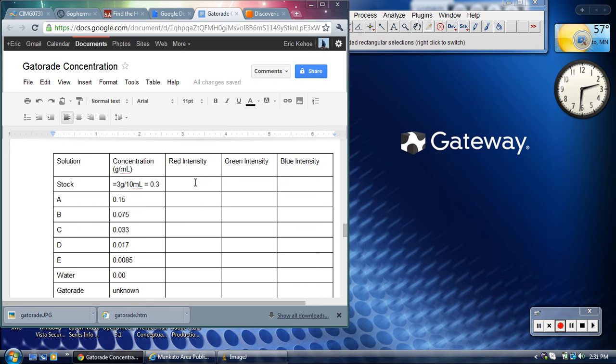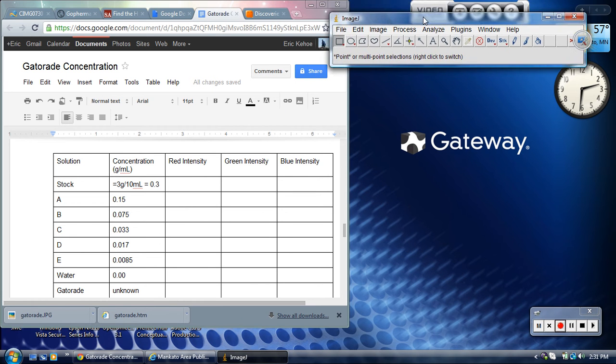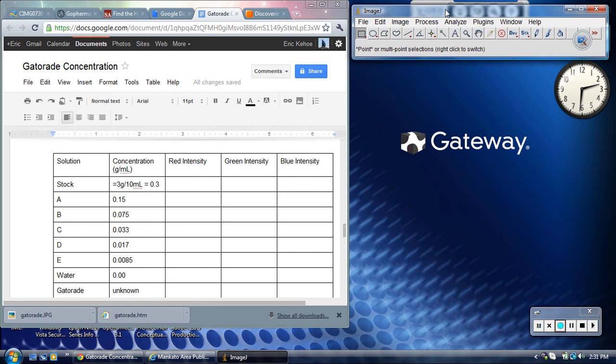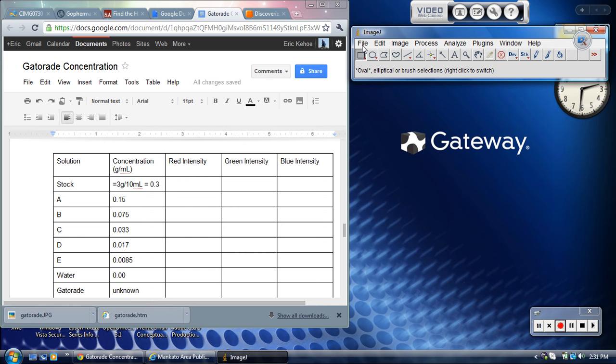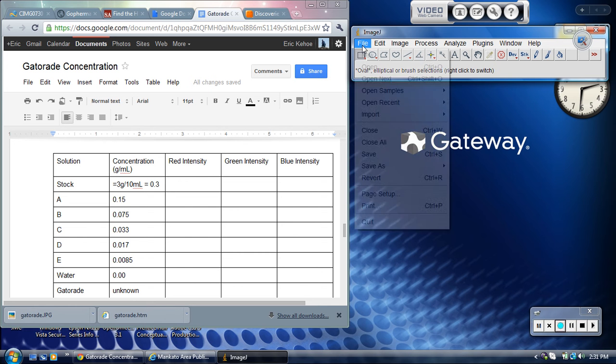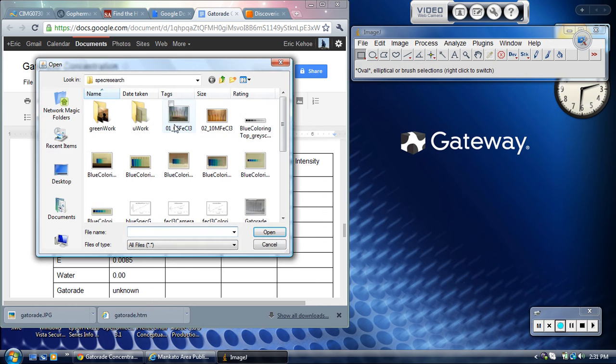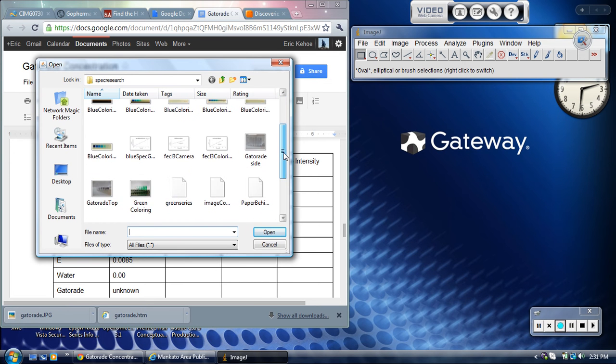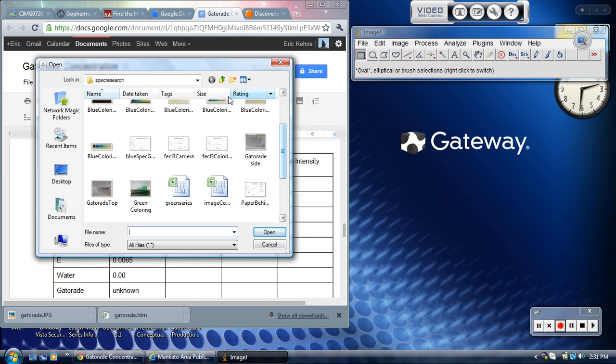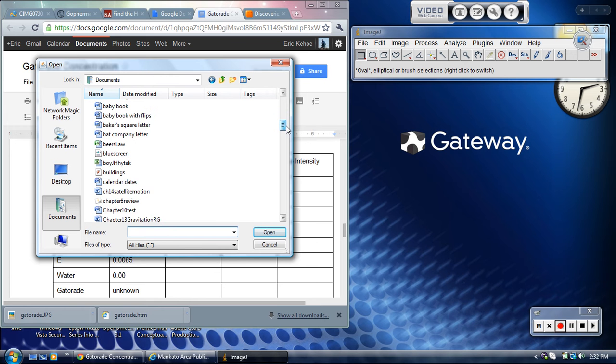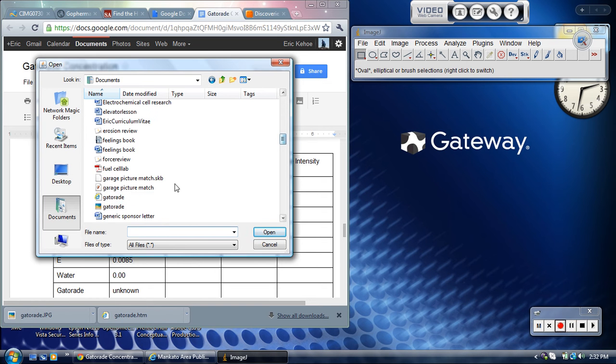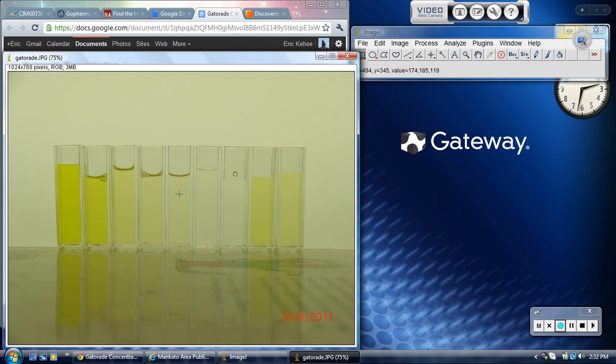The next thing is how you get these intensities. For that, you need to open up the image. You want to use this program called ImageJ. You should be able to find the shortcut to it on the desktop of my computer, otherwise you're off in the start menu. Just like any other program, file, open. You need to find it from wherever it's been saved. There we go, there's my picture.